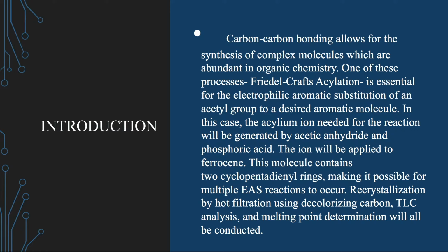So carbon-carbon bonding is essential for the synthesis of complex molecules, which are abundant in organic chemistry. One of these processes, Friedel-Crafts acylation, is essential for the electrophilic aromatic substitution of an acetyl group to a desired aromatic molecule. In this case, the acylium ion needed for the reaction will be generated by acetic anhydride and phosphoric acid. The ion will be applied to ferrocene.